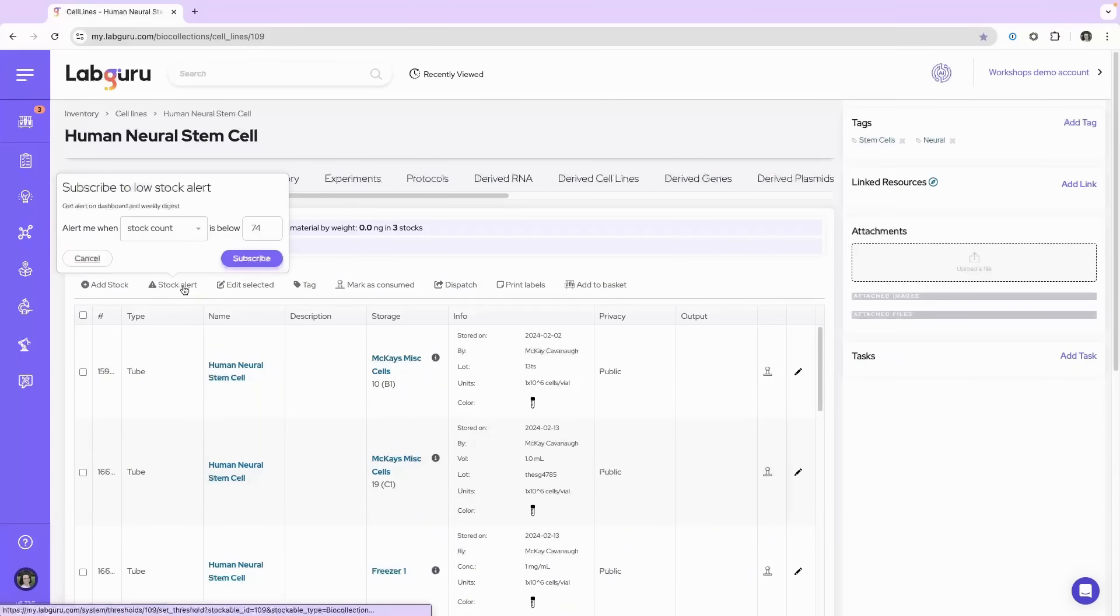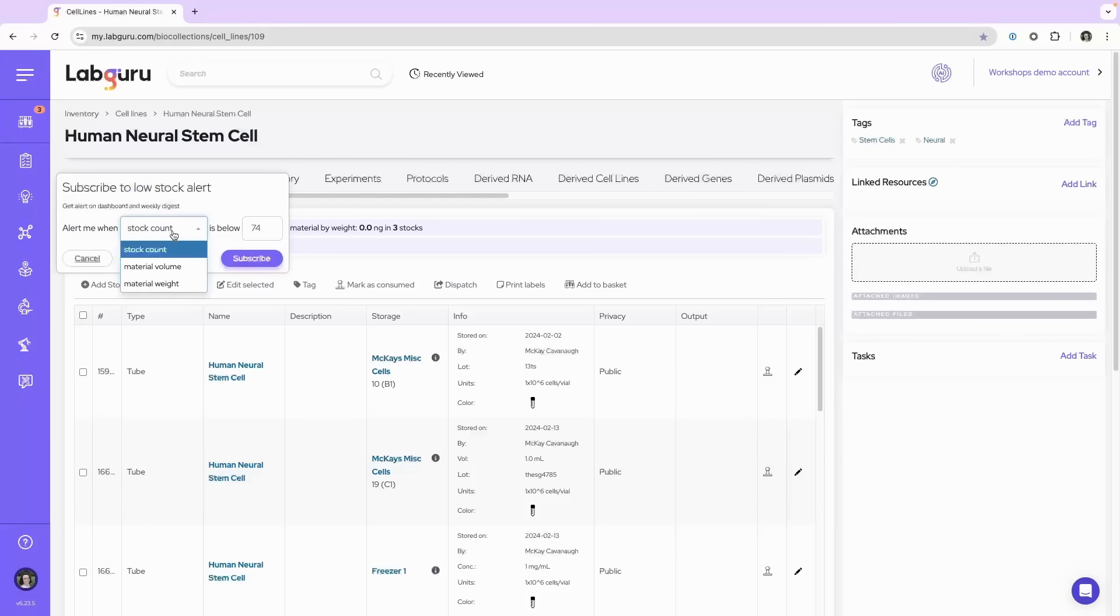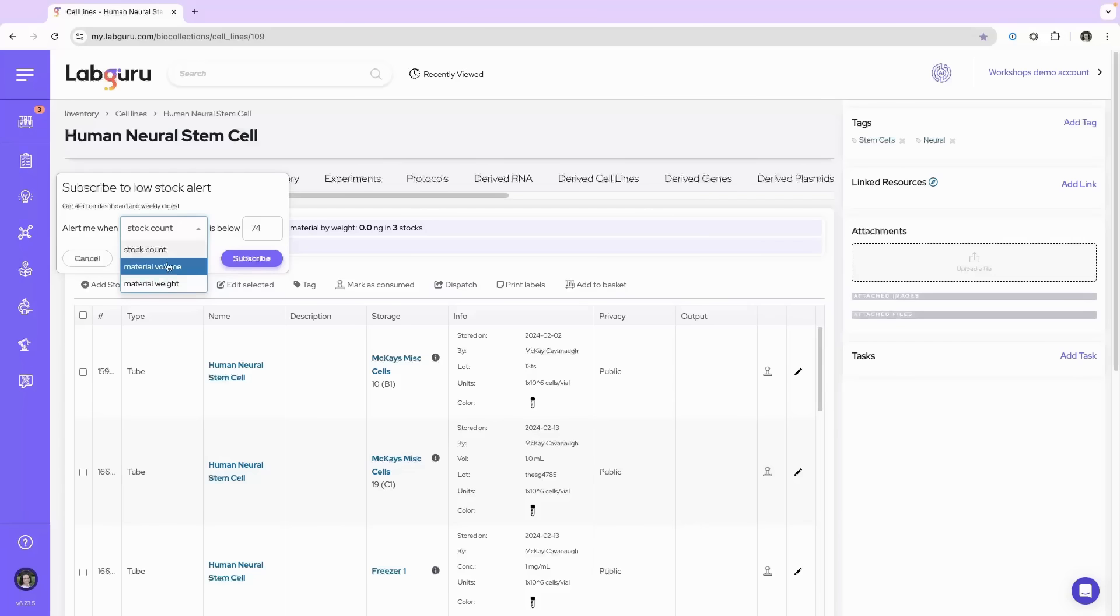When I click on the stock alert, there are three options that I can choose to set a threshold for the stock alert. The first is stock count, second material volume, and third material weight.